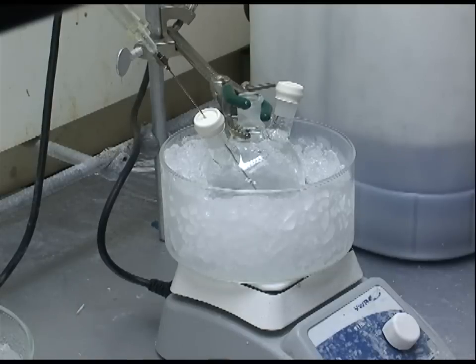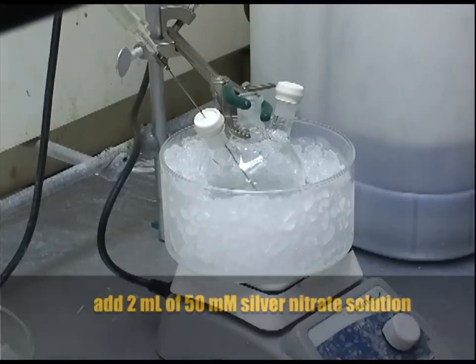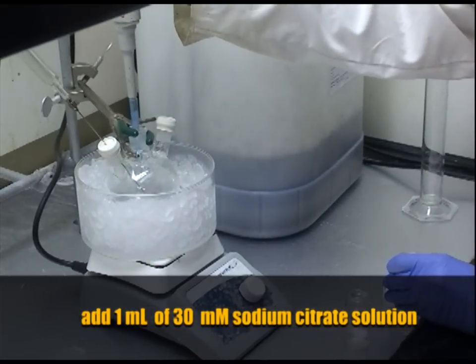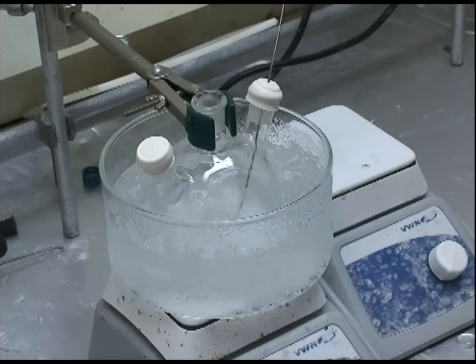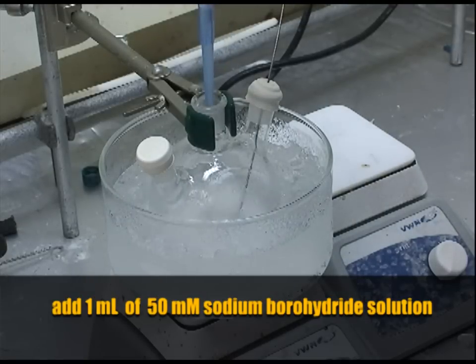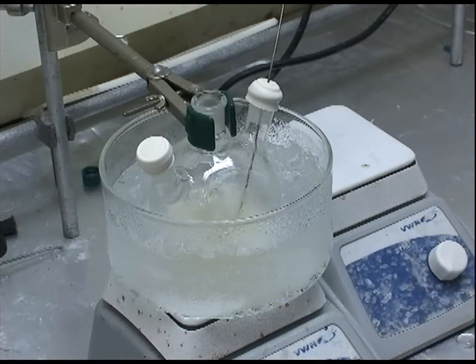We add 2 milliliters of our silver nitrate stock solution and 1 milliliter of the stock sodium citrate. After about an hour of purging, we add 1 milliliter of sodium borohydride to the silver and sodium citrate solution. The solution should turn a very pale yellow.